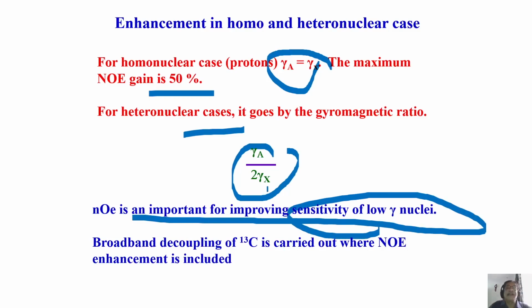There can be maximum enhancement of the signal. This is precisely what we saw in carbon 13 NMR, where we did the decoupling with NOE and got more signal to noise ratio. When we did the broadband decoupling in carbon 13, I told you it had an NOE factor built into it. That's why in the heteronuclear case, especially with low gamma, this NOE factor is very important to get a better signal to noise ratio.